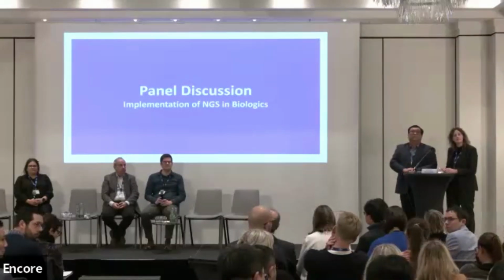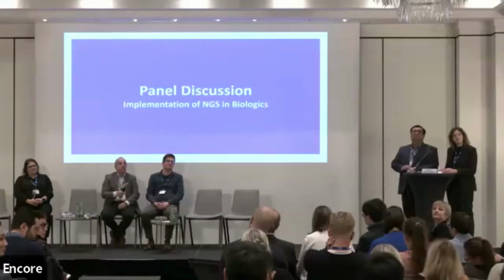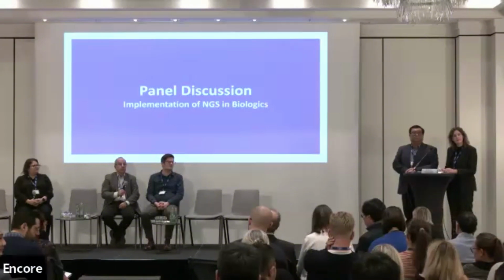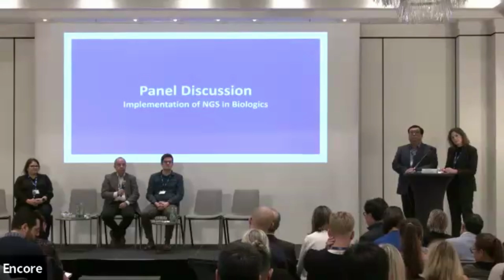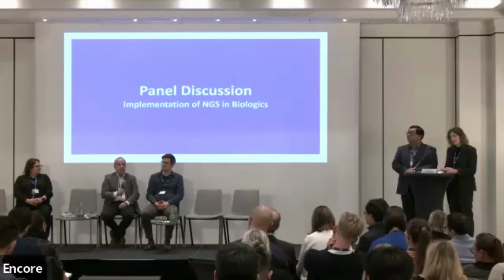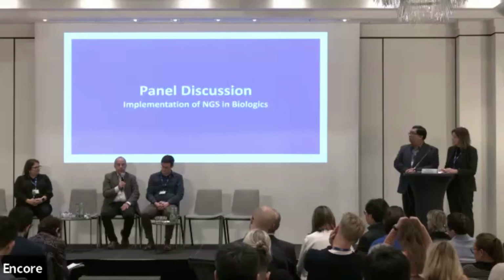Hi, this is Xu Yang from NIFDC. I have a question to ask Robert. You mentioned that in the future you plan to detect retrovirus. As we all know, if we use human-derived materials, there are a lot of endogenous retroviruses. How do you distinguish the endogenous retrovirus from the exogenous? Have you done any trials or designs? Thank you.